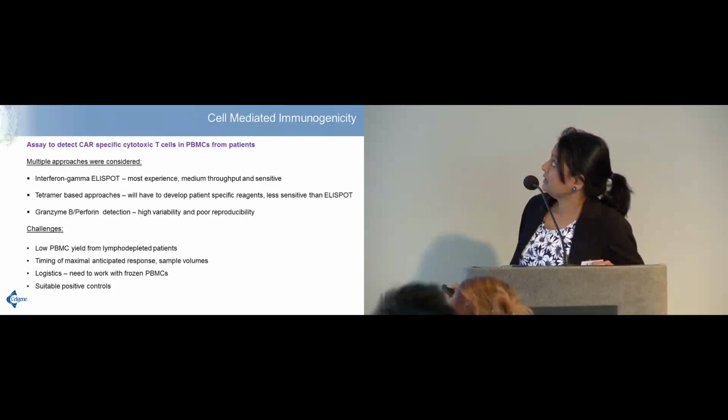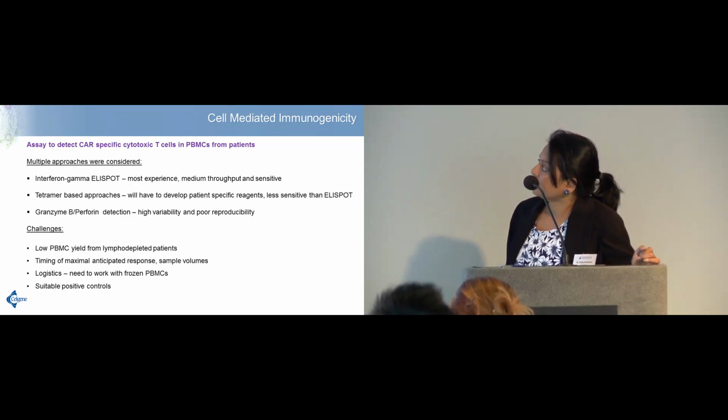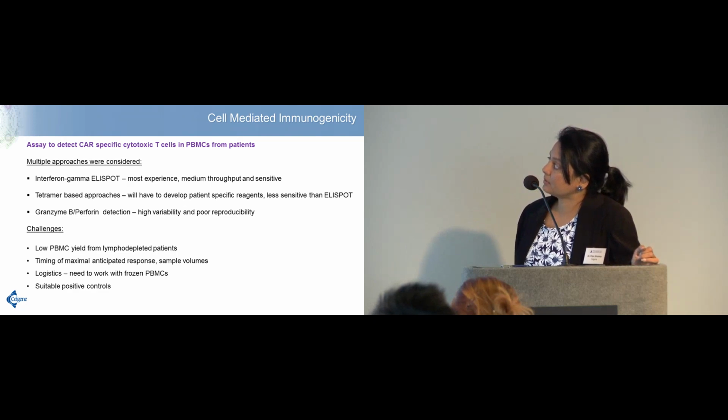So on to cell-mediated immunogenicity. This is the work that we did with ProImmune, where we wanted an assay to detect CAR-specific cytotoxic T cells in PBMC samples from dosed patients. And we initially thought about what would be the best approach.